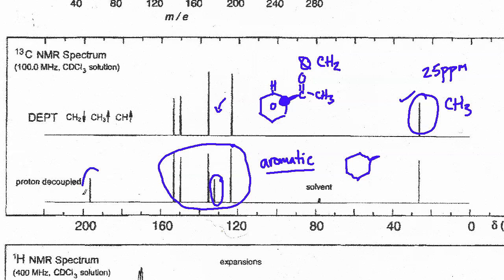And then we can definitely confirm, again, a carbonyl. Carbonyls are also quaternary, so they disappear up in the DEPT, but especially right around 2, this is probably at 195 ppm. When you get up that high, close to 200, it's almost always a ketone, and that is exactly what we're suggesting, an aromatic ketone right there. All right, so some useful information here.